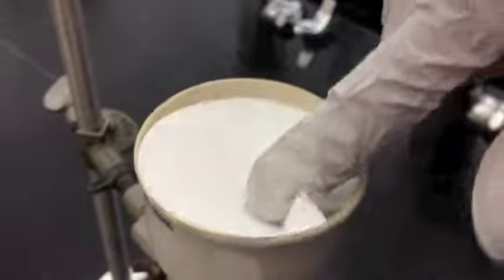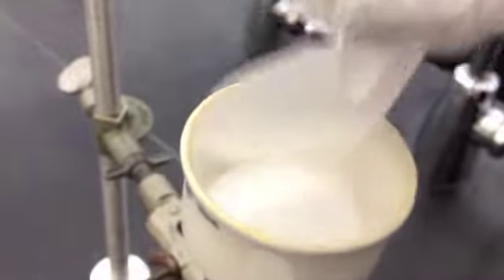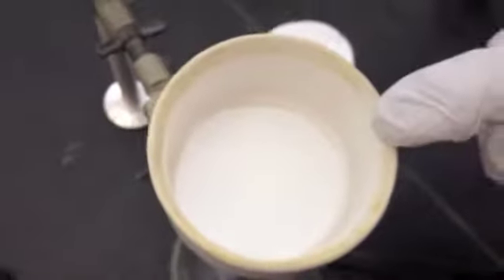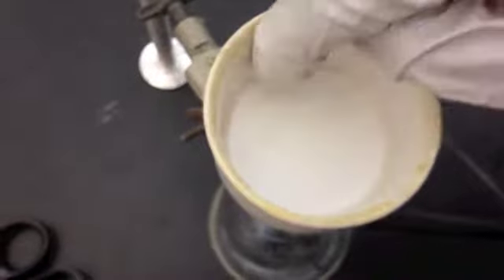Now, you don't want your filter paper to actually form any folds here on the side. You want it to fit nicely inside of it. So I've already cut it and put it here in a good size. As you can see, all the holes are covered and there's no folds around the edges of the Buchner funnel.